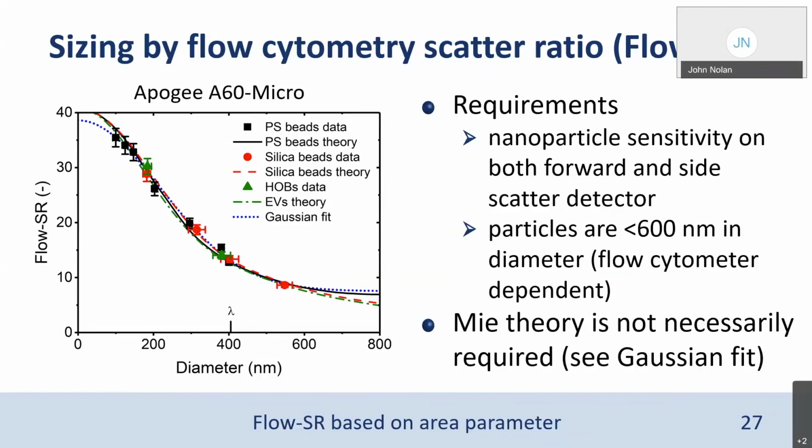Okay. So another question about refractive index. Does cargo also affect refractive index? Yeah, cargo does affect the refractive index, else there would not be a difference between EVs and lipoprotein particles. Whether the cargo of EVs causes a difference large enough to be measured with this technique, I don't know. We didn't study that.